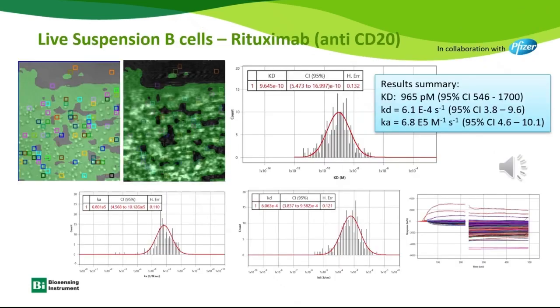So far, the examples I have been showing you are mostly with adherent cells, and also they are fixed. Many people have been asking whether we can work with suspension cells instead of adherent cells, and also whether we can work with live cells instead of fixed cells.